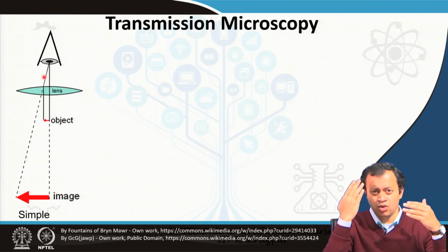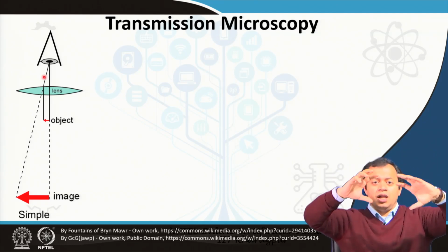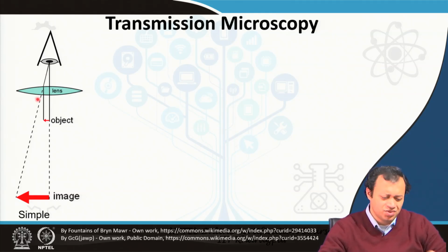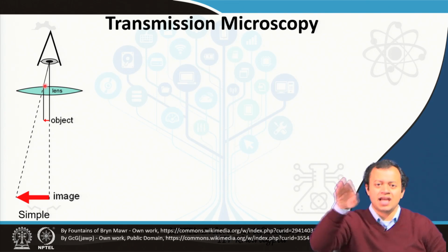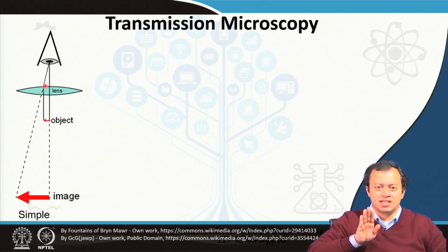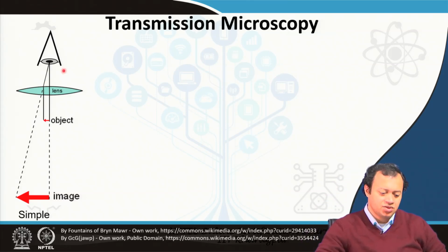One is a blue plate, one is a red plate, and you feel like there is a 3-dimensional person coming from your screen, the 3D films that you see. So, it's a very, very simple technique. It is a lens. Our eyes cannot see the light bending like this. Our eyes see the light as going in a straight path, so the straight paths converge and you have a simple magnified image.